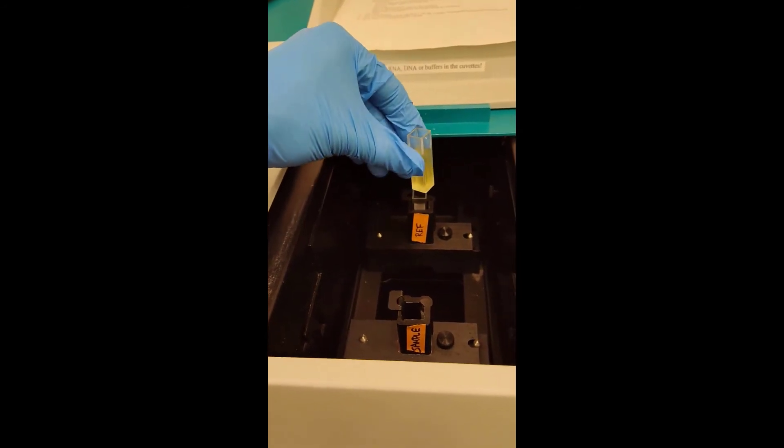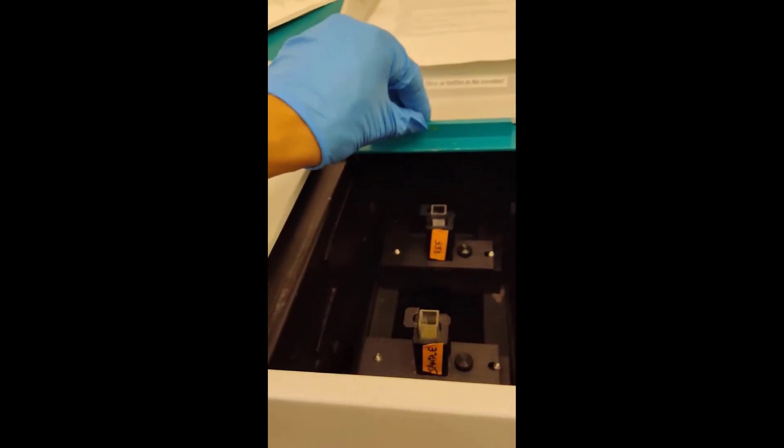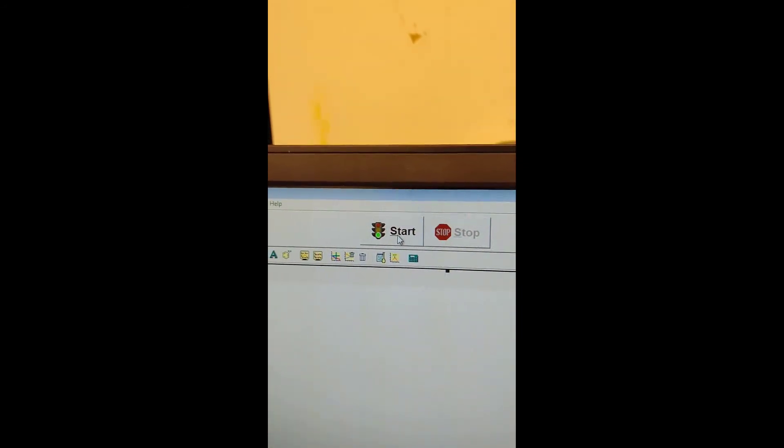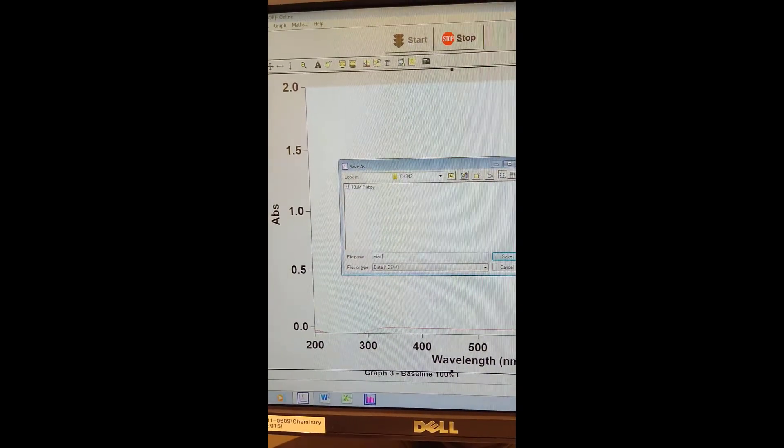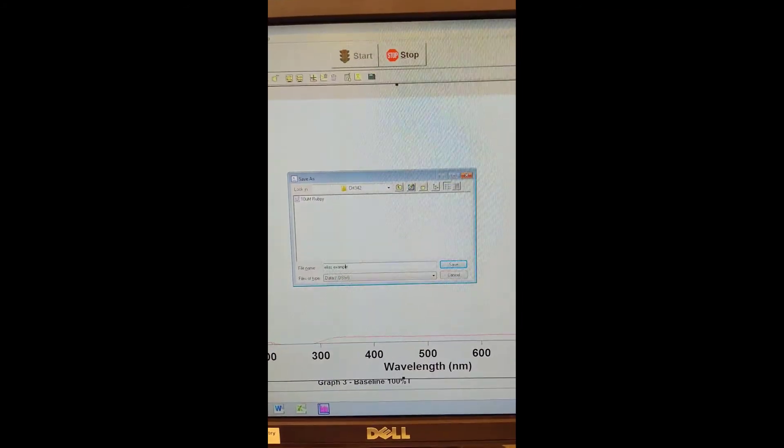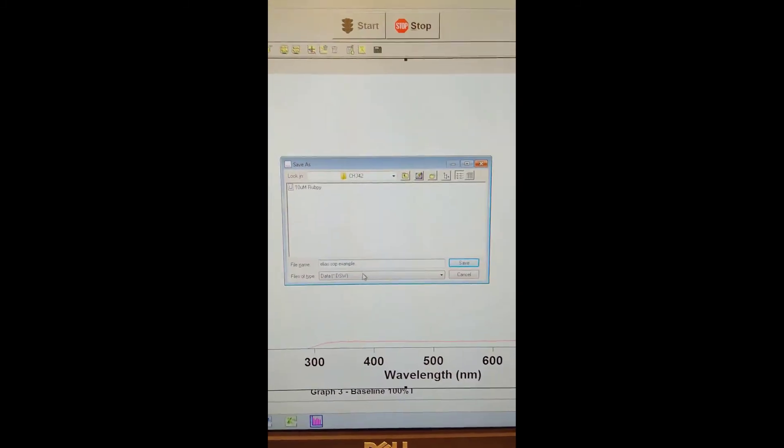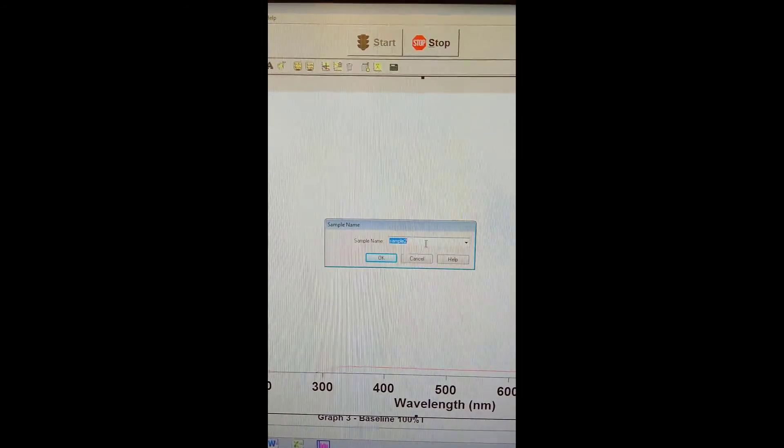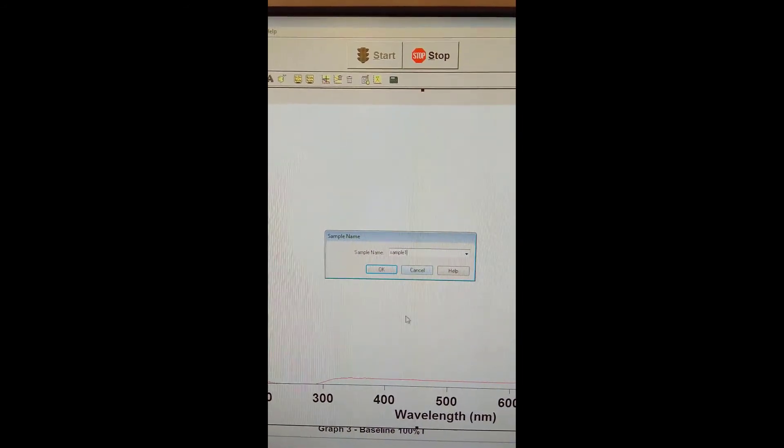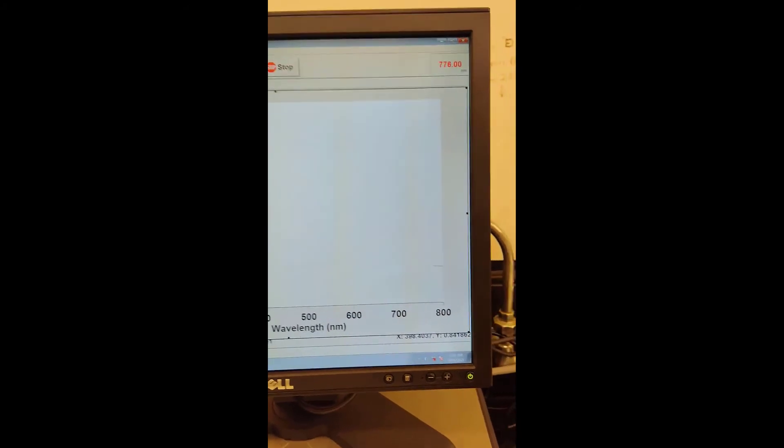I'll clean the sides to make sure the transparent windows are nice and clean. Then I'll load it into the sample compartment, close it up, and collect the spectrum. It's going to prompt me to give it a file name. Make sure you're saving it into the folder you want. Give it a name and make sure you're saving it as a DSW file. Then give it a sample name to help you keep track of your various samples. Hit OK, and it should start to collect the spectrum.